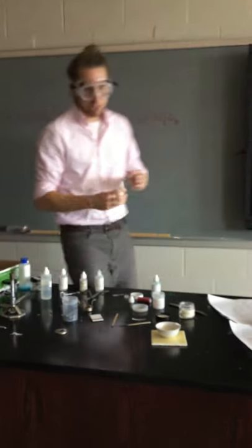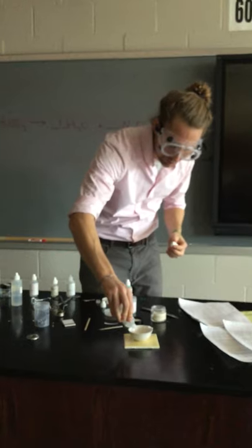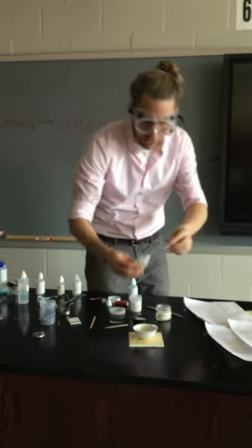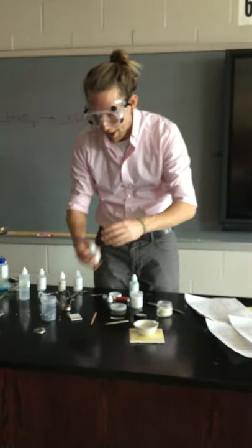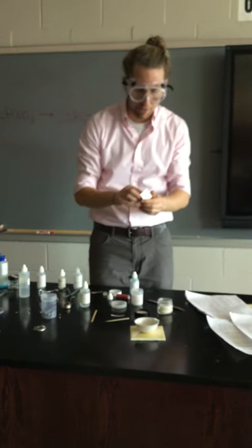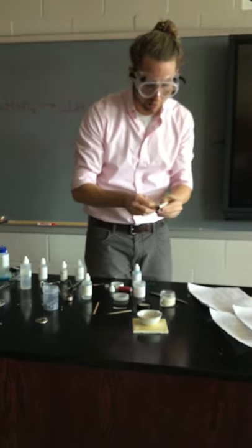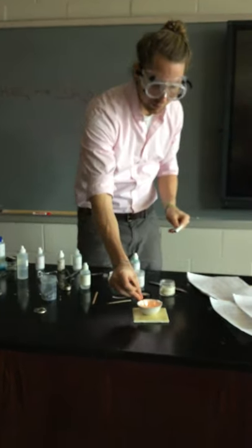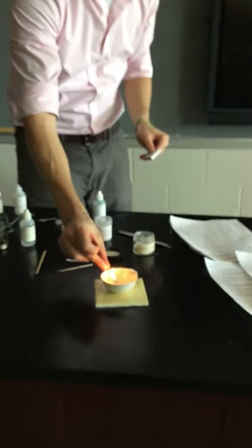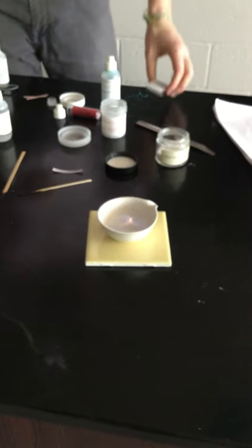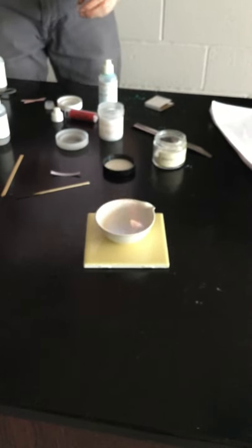Into that evaporating dish, I am going to put several drops of ethanol. And then we are going to light that ethanol on fire. And it's a little bit hard to see, but with the lights out, hopefully, we'll be able to pick it up on camera. So you can see kind of a blue-yellow flame there.